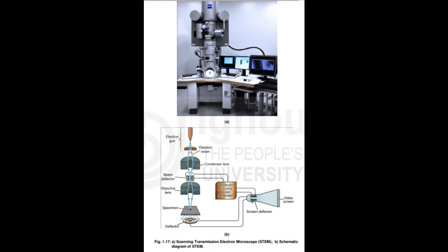1.3.4 Environmental Scanning Electron Microscopy, ESEM. Environmental Scanning Electron Microscope, ESEM, is a specialized SEM in which uncoated specimens are analyzed. The first commercial ESEM was produced by the Electroscan Corporation in USA in 1988. The instrument produces high-quality and resolution images in wet samples and those contained in low vacuum or gas, Fig.